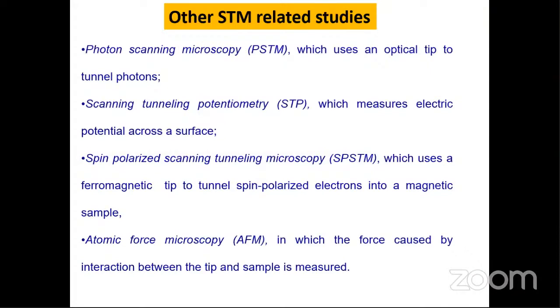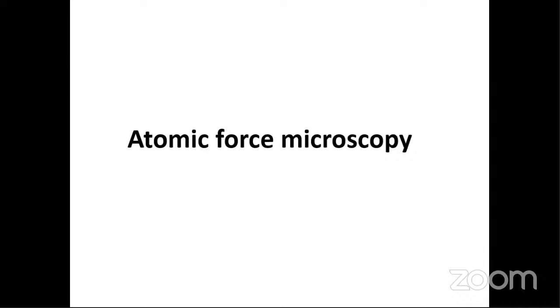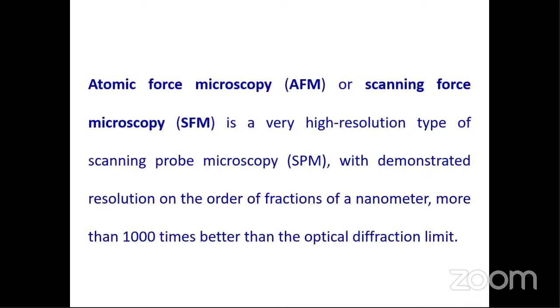I shall discuss one more microscopy, which is atomic force microscopy. This is another kind of microscope that is also used to study the surface roughness of a sample with high resolution. Let's see the basic principle over here. As I said, this is not clear, so let's directly go to the principle.